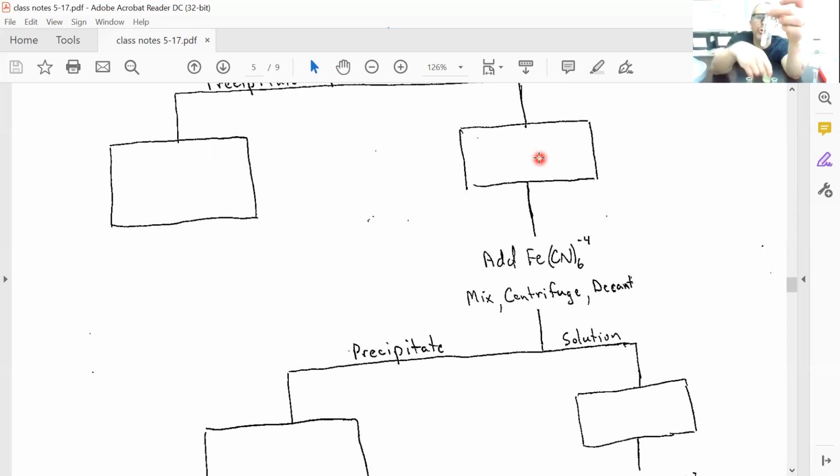It looks kind of cloudy as I'm adding the drops. If it gets cloudy as you add the drop, that's a pretty good sign there is a precipitate. Notice it's a little different when it gets mixed with other stuff than what it might have looked like before, but it's that whitish, dingy, yellowish precipitate right here.